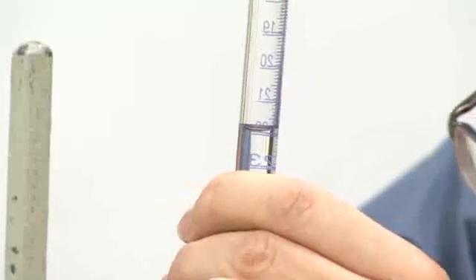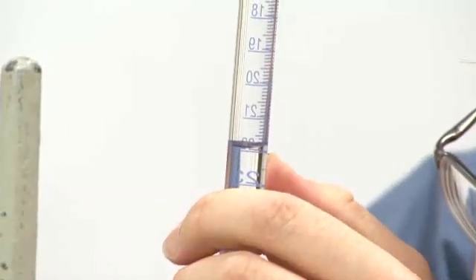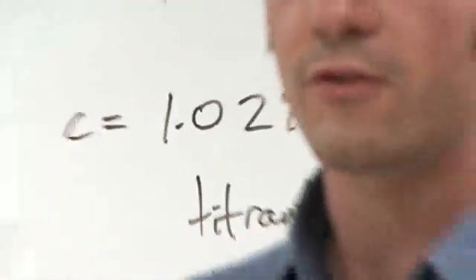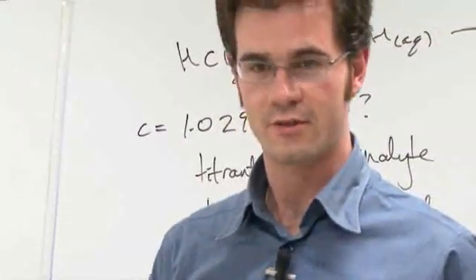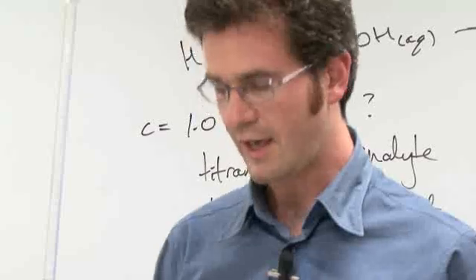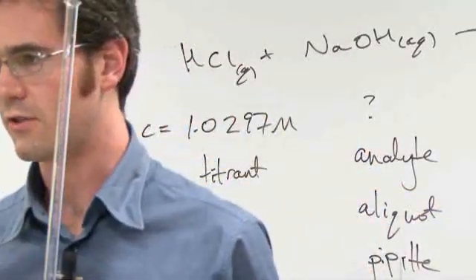Now for your rough experiment, you need to record the volume. We look up here and you should get it to the closest 0.05 mils. By the way, each drop is 0.05 mils. So you get down here, it reads 21.95. So you write that down. The good news is that you have to do titration several times to confirm that your result is correct. And also if you go over, there's something called back titration.